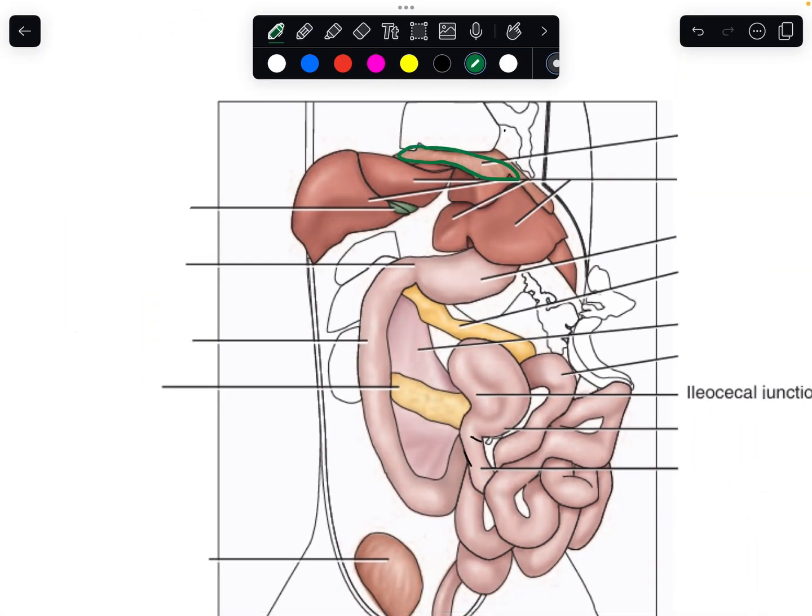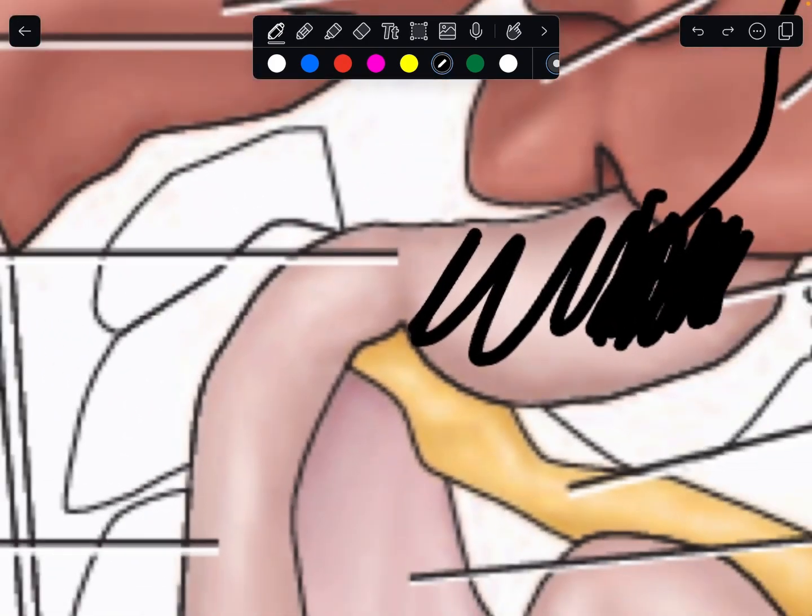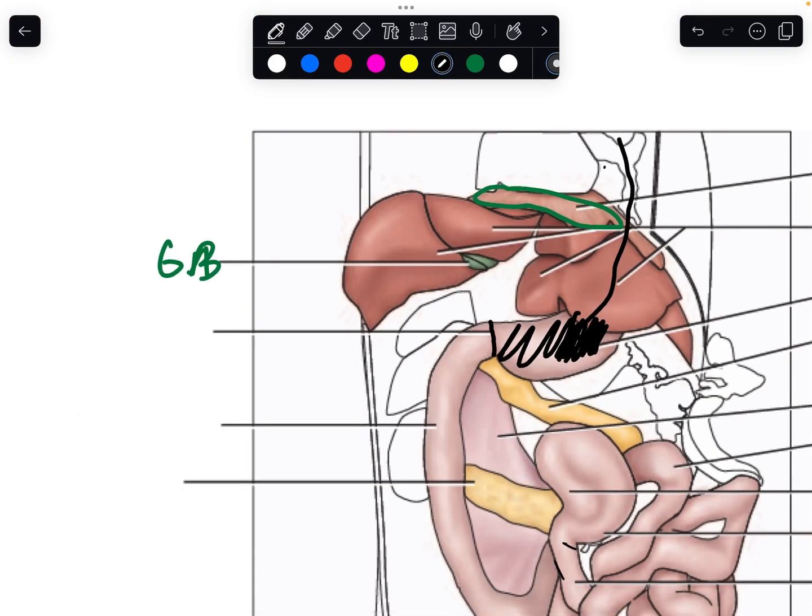This is the diaphragm, right? And beneath the diaphragm is the gallbladder and the liver. The lobes of liver. And then here, as you can see, goes here, boom, we meet the stomach, right? We're in the stomach now. You see this little structure right here? That's called the pyloric sphincter, or it can be known as the pyloric valve.